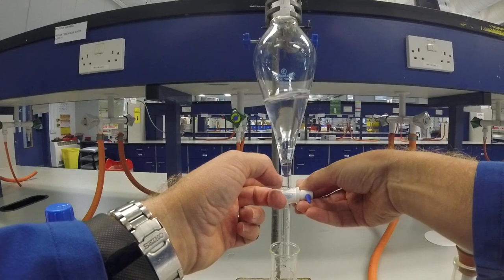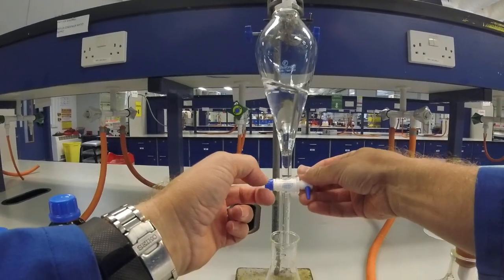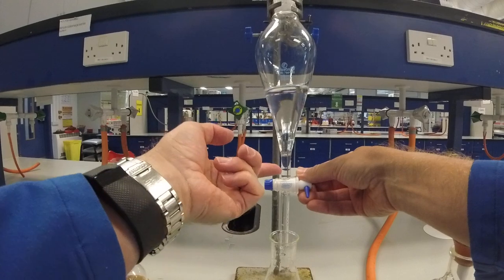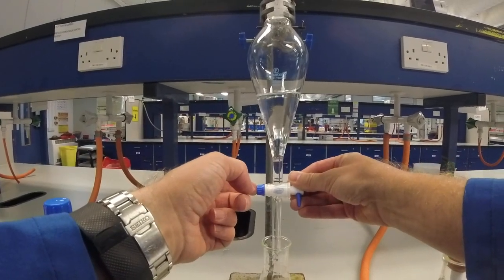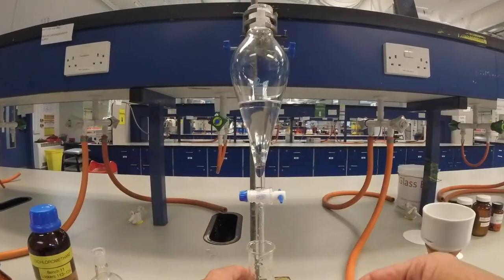Give the separating funnel a little swirl to move anything else down. Sometimes you see that layer go up quite a lot as more water comes out. And then bring it down and cut it off there.